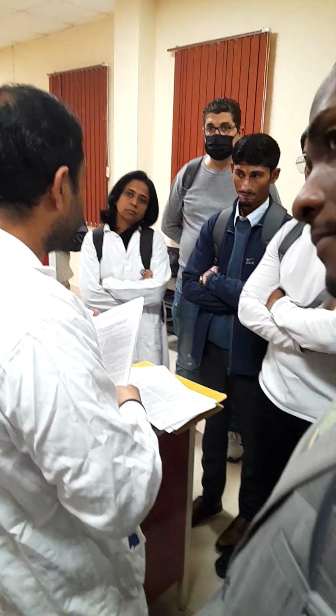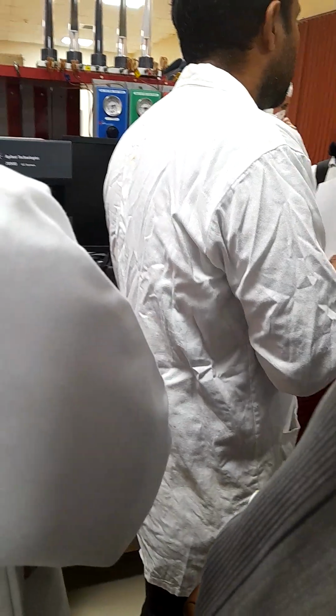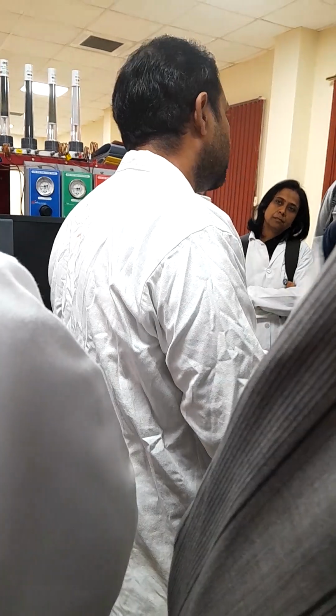Residues or high temperature residues are very tough to get. In this application you get up to 720. Beyond that you will get a residue only. But the issue should be starting from 100 to 1. Or a temperature setup which can liquefy these gases also, so that you can get it vaporized here and get low loss of the C3 or C2 hydrocarbons.